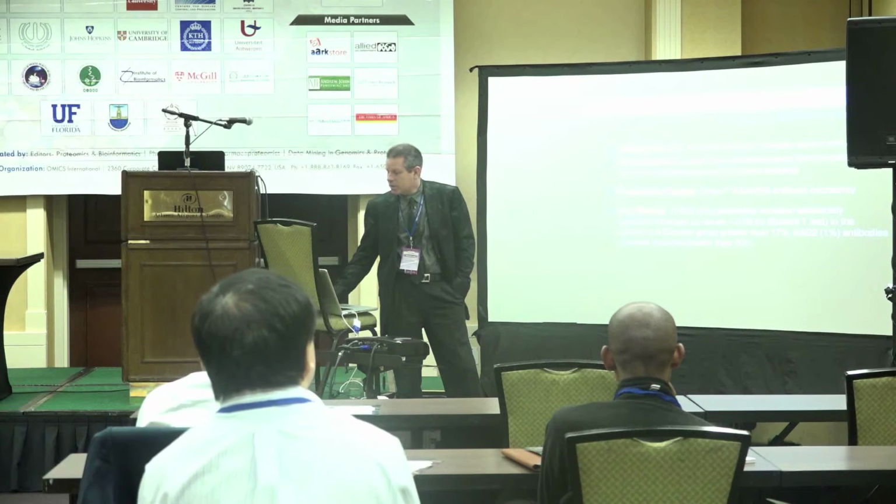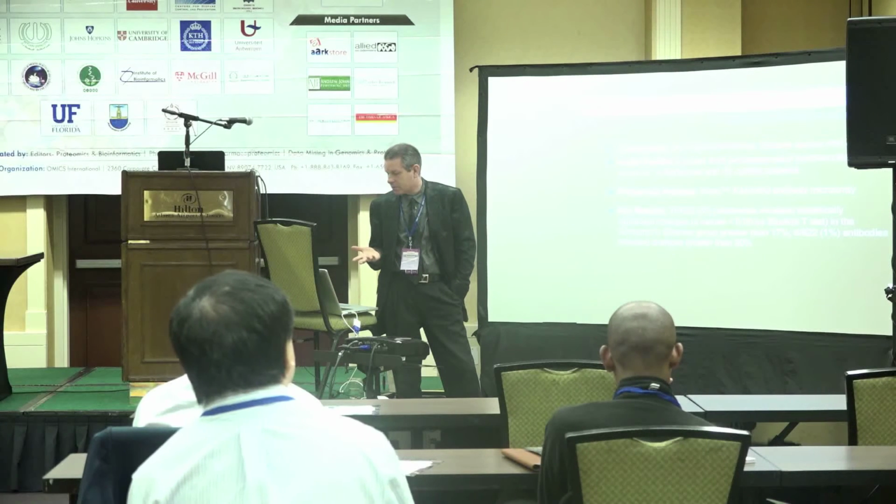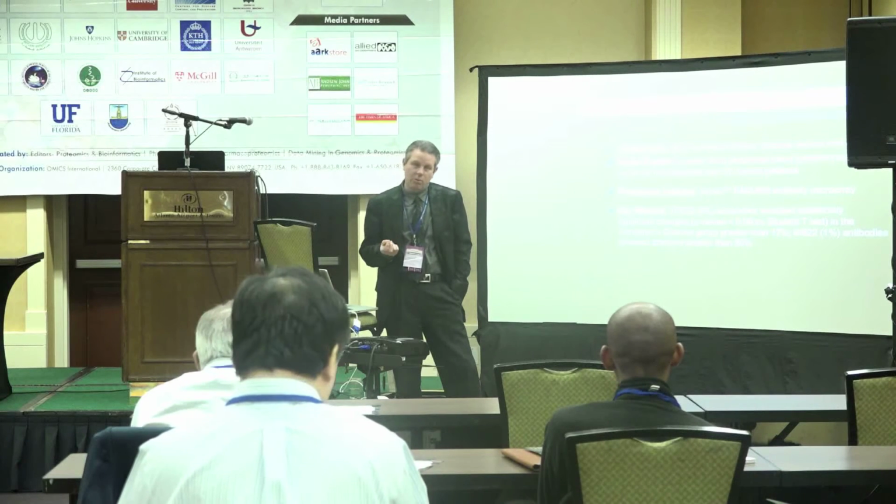So we use these microarrays in different applications. These are some of the earlier applications, but I like to present it because it illustrates some of the issues that we're dealing with in biomarker discovery.